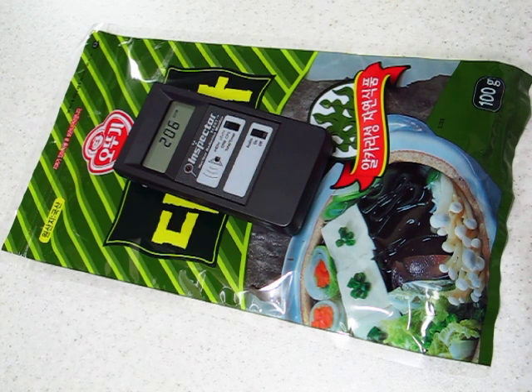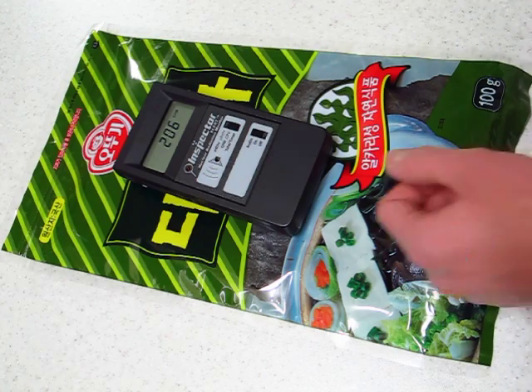Okay. So, let's remove the seaweed and see what the background reading here is.